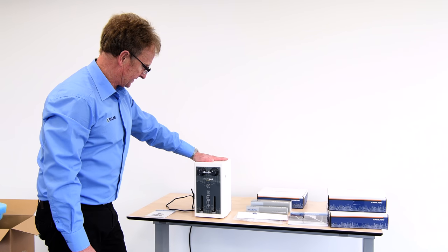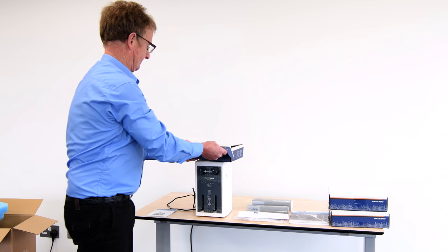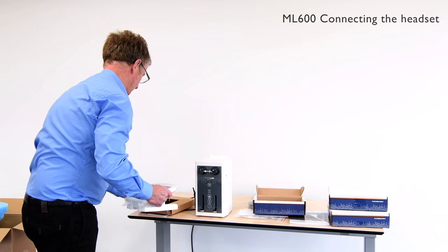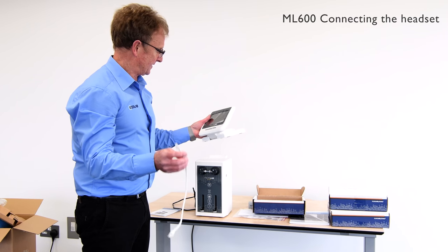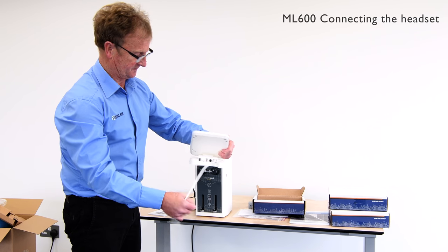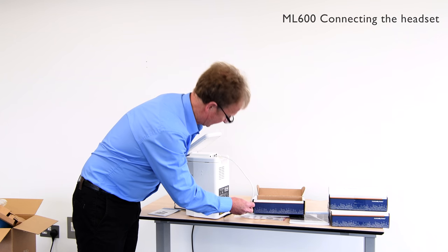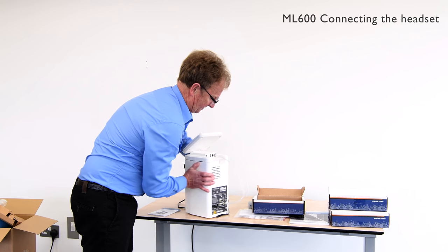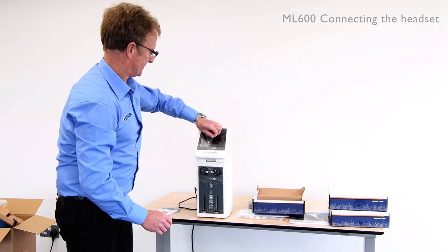So now we have the power supply fitted to the unit and now we're going to connect the headset. The headset comes complete with an ethernet cable which connects to the back of the instrument, assigned to a port here. We'll remove the film from the top of the display.